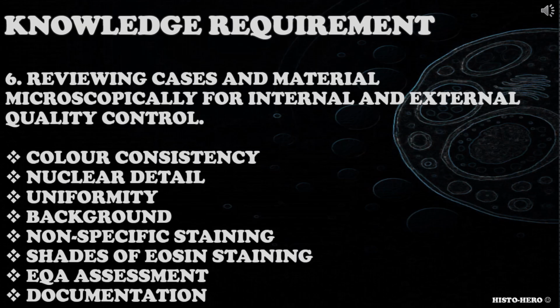When addressing this knowledge requirement, candidates should consider color consistency, nuclear detail, uniformity of staining, presence of background staining, presence of nonspecific staining, presence of various shades of eosin staining, EQA assessment criteria, documentation.